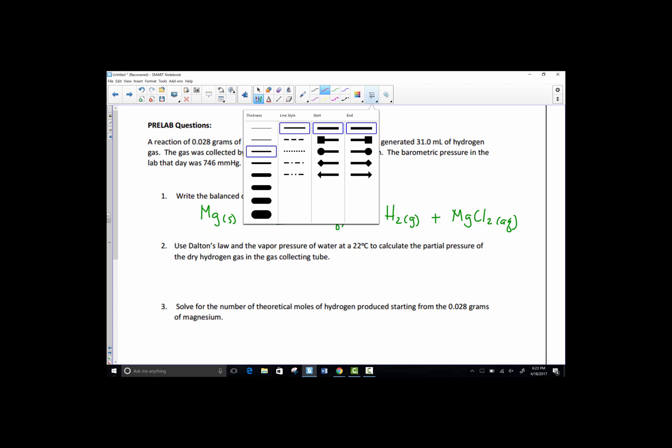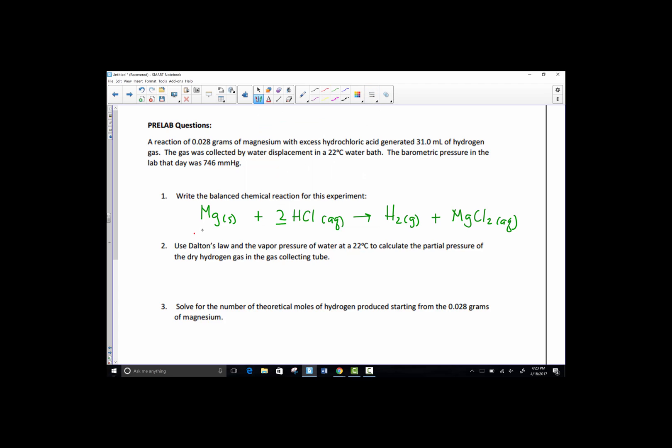So here's some information that was kind of pertained to us, and I'll just record it underneath here. We had 0.028 grams of magnesium solid. We had excess amounts of hydrochloric acid, so we poured in plenty to be sure all of the magnesium ribbon was consumed. And that's how you'll know your reaction has gone to completion, because literally the magnesium's gone. You don't see it anymore, and all of the bubbling has stopped.